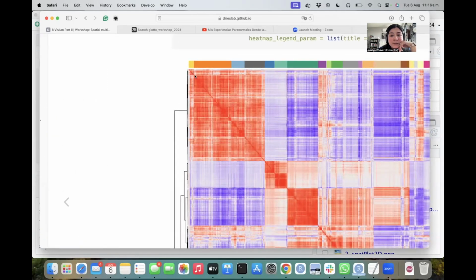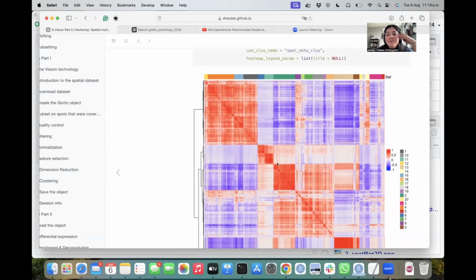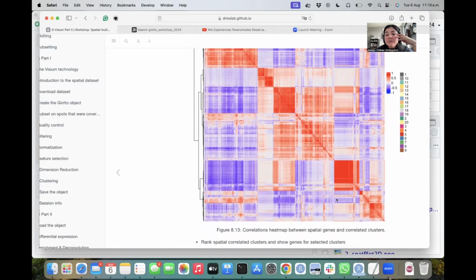For example, this one in the corner, then here kind of a square, then this other square. But you can play with the number of clusters to find the best one. Then, for example, here it is identifying another cluster. Here it identifies kind of a big square, but also 2 small subclusters. So that's why it's divided them in 2, and so on.